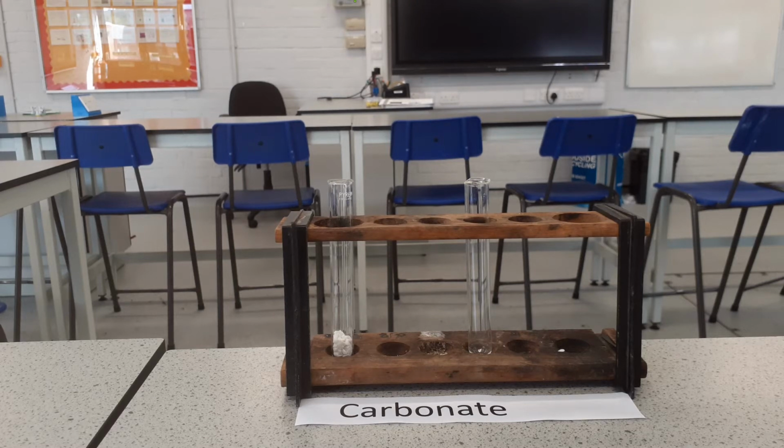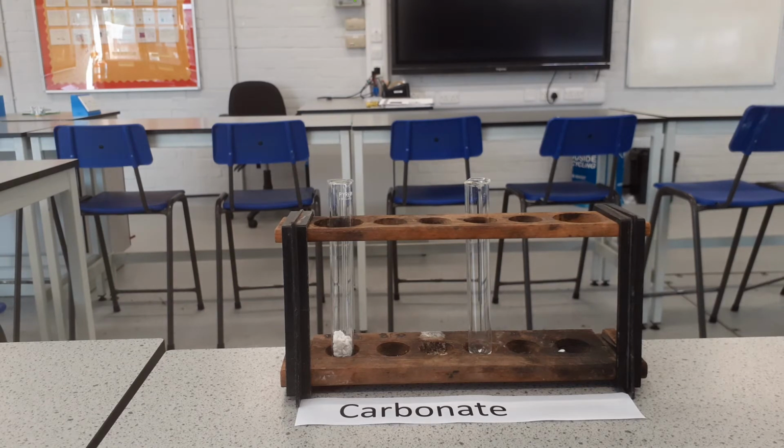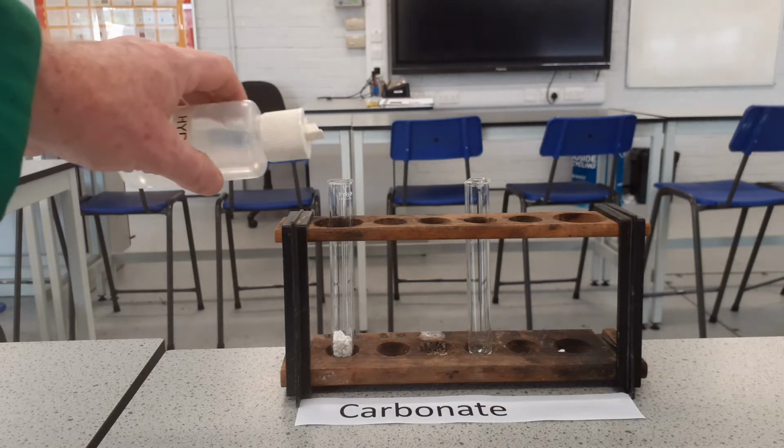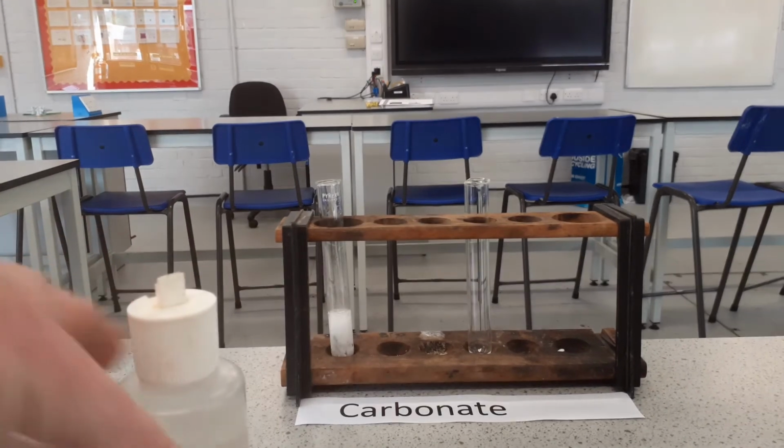Okay, this is the first of our anion tests. I'm going to test for carbonates. So in the test tube here, I've got a carbonate. I've got calcium carbonate, but it could be any carbonate. It doesn't matter. All carbonates will do this. So the first thing is, if you add hydrochloric acid, the obvious thing you will see, it fizzes.